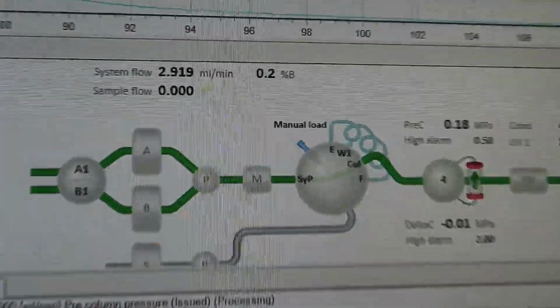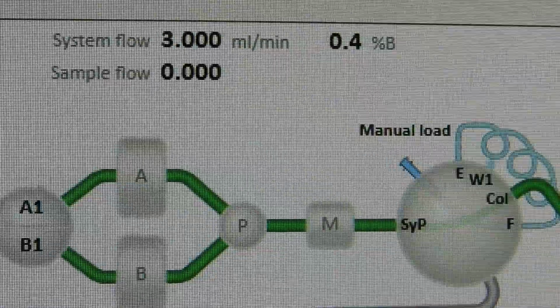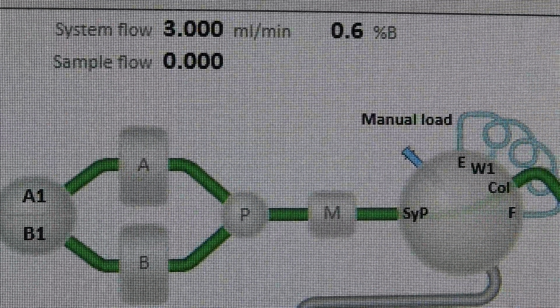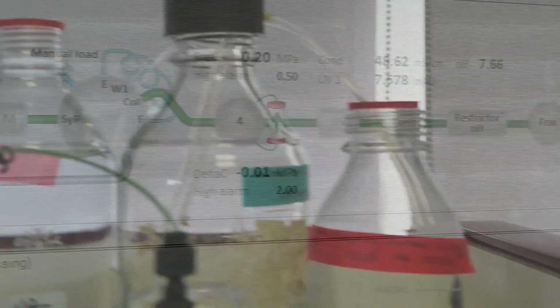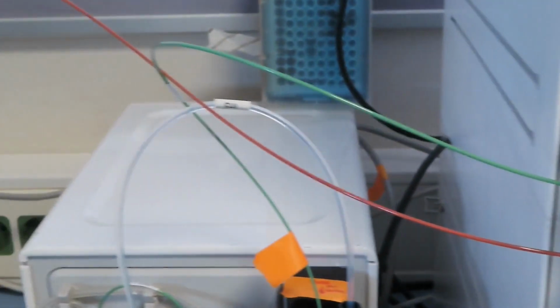It's time for the elution of the proteins bound to the resin. For this purpose, a gradient of the elution buffer is applied. Its concentration is gradually increased to be able to separate proteins with low affinity from those with high affinity. As an elution method, we normally use imidazole, a histidine analog that competitively elutes the bound polyhistidine residues by disrupting the binding between histidines and metal.